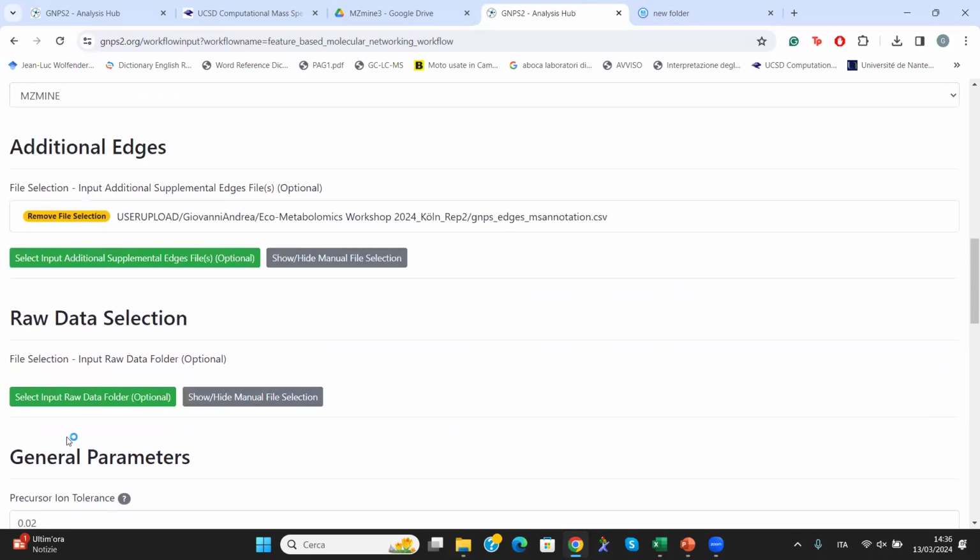Also, maybe just to calm you if you did not make it to that point, Giovanni has an already finished job that he can share with you in a second, and you can build up from there. That's first of all to take you all with us to the next step, but also so we're not all hitting the server at the same time, because if 60 people simultaneously hit the server, performance gets interesting.